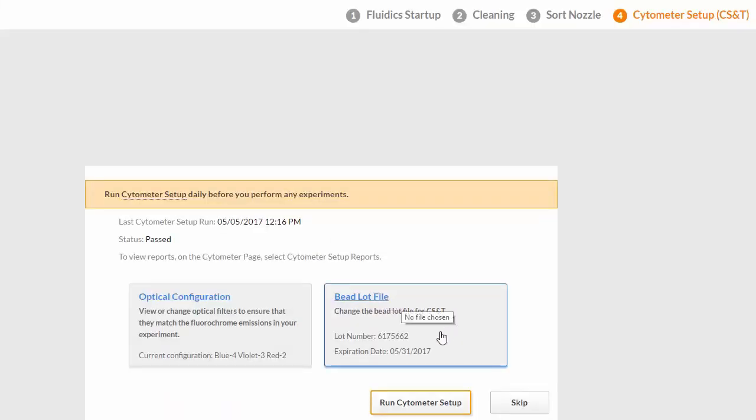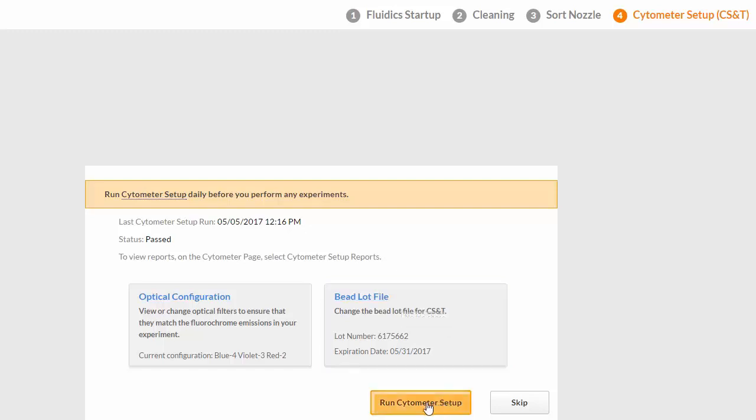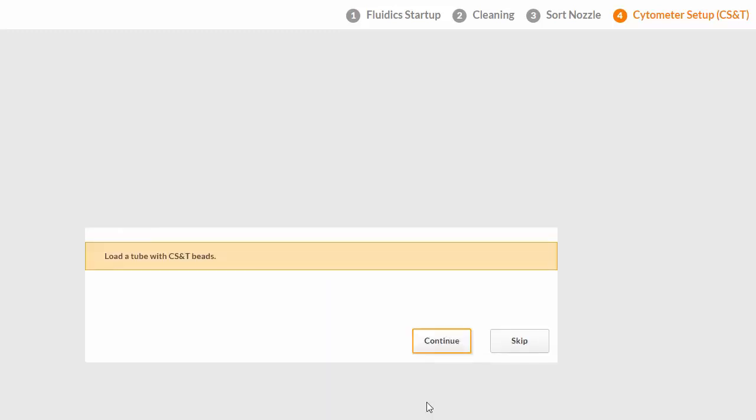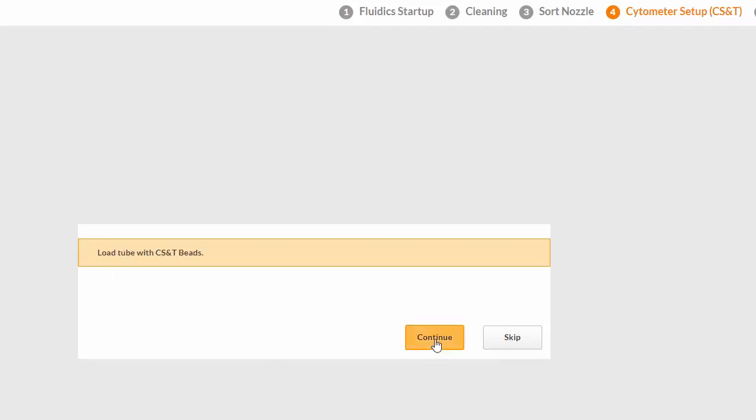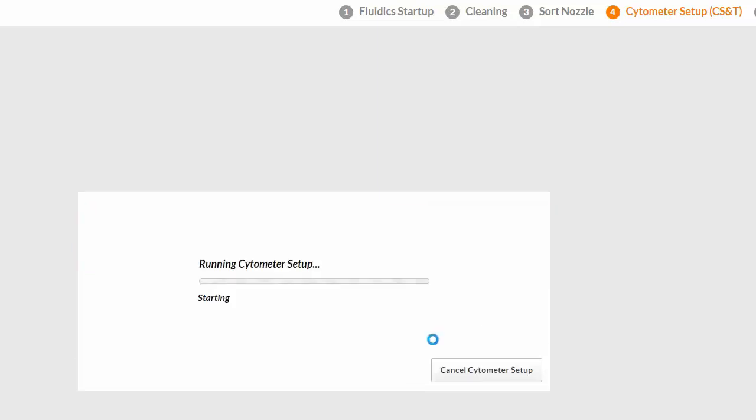Click Run Cytometer Setup. Load the tube with CSNT beads and click Continue. The system displays the current step with a progress bar.